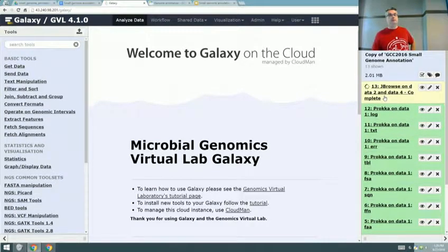So anyway, if you view your JBrowse now, it should work. I have a question with the JBrowse. It shows all three reading frames, but how do you know which one it's referencing when you click on that segment? Can you hassle the JBrowse people next week at the GMod conference to fix that? No, not this week. Straight after.